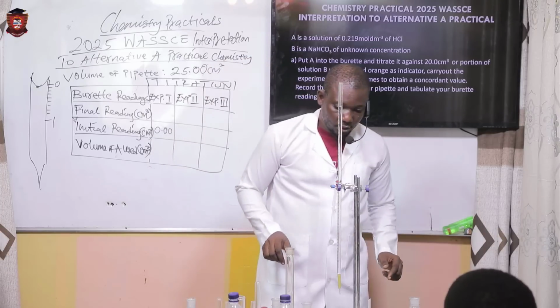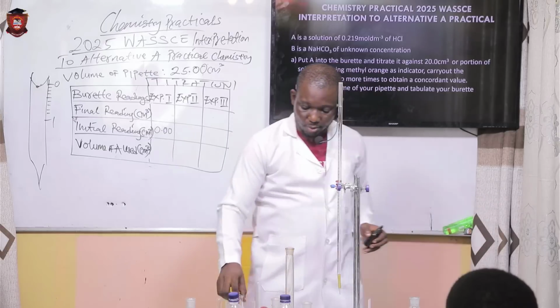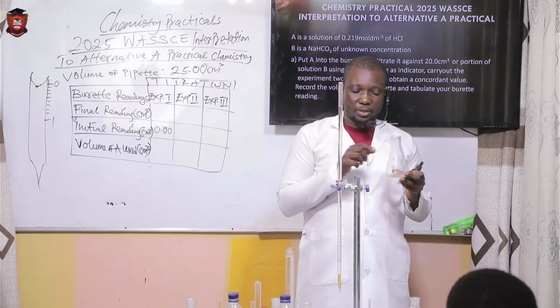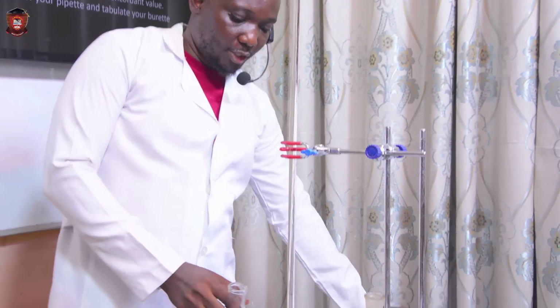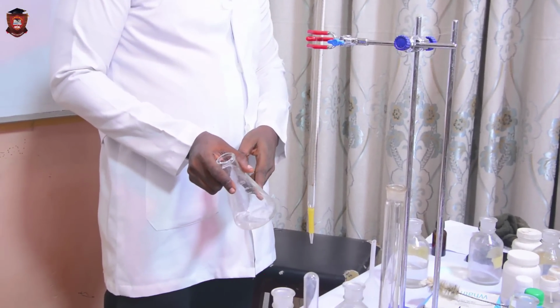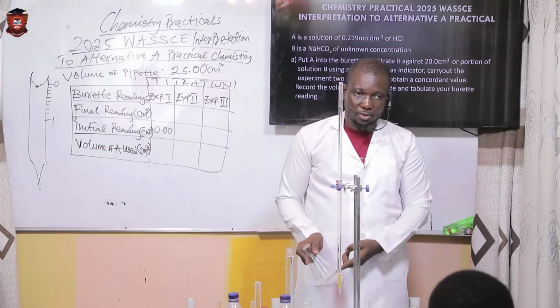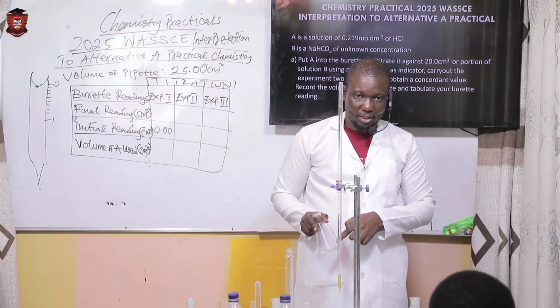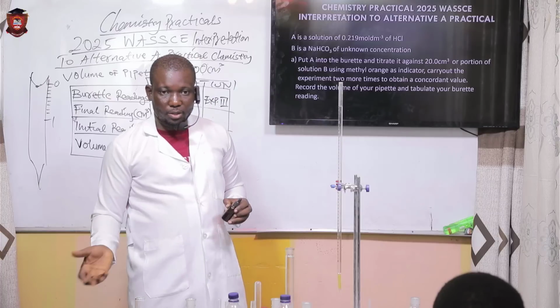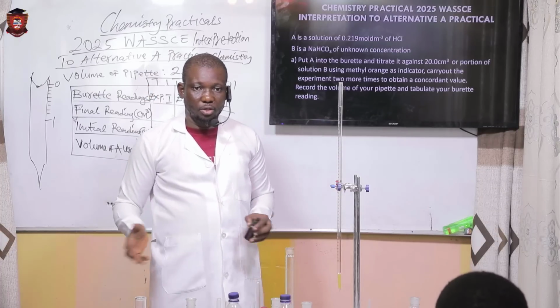Okay, then you have to use, because now listen to me, the color of this analyte is the same as the color of here. So if I start to mix these two solutions, there is no point I will know that the reaction is complete. I wouldn't know. So something to indicate that the reaction has taken place here is what? Indicator. The indicator changes color according to the medium of the solution.